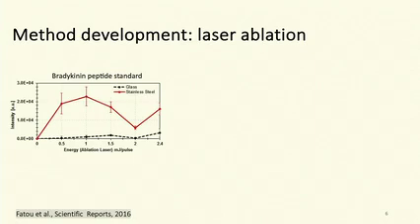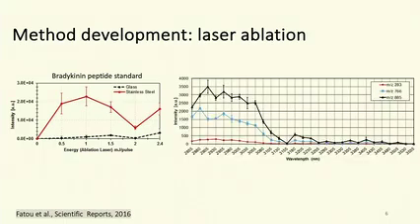So even the receptacle of the sample can play a huge role in your data generation and subsequent data analysis. The other thing to look for is the wavelength of your laser, and this is something you need to consider together with your sample matrix. So what type of wavelength your sample matrix will absorb best.